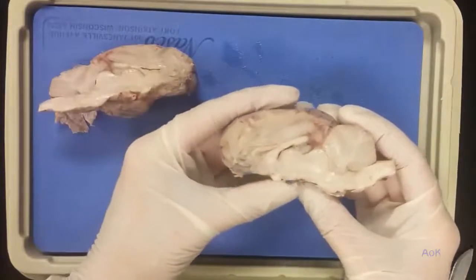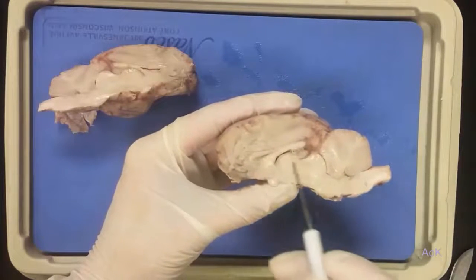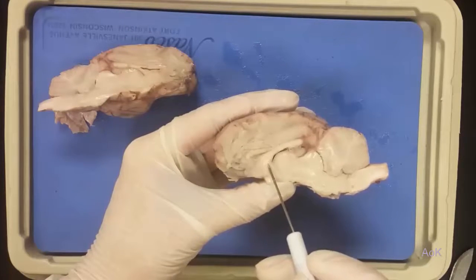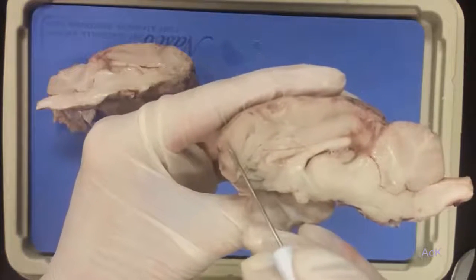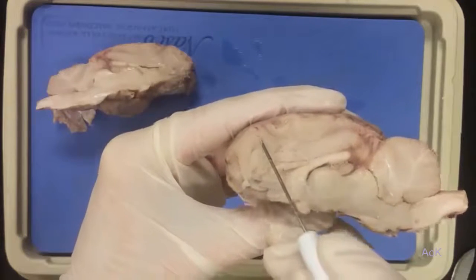Now we can see the internal structures of the brain. Notice that there's a very light-colored part. All of the light-colored parts are called white matter, and they are made up of the myelinated axons that are part of the neurons in the brain. The darker layers are called gray matter, and those are the soma bodies as well as the dendrites.